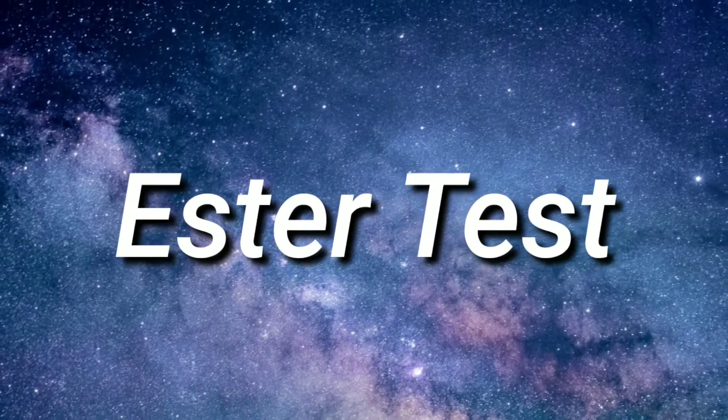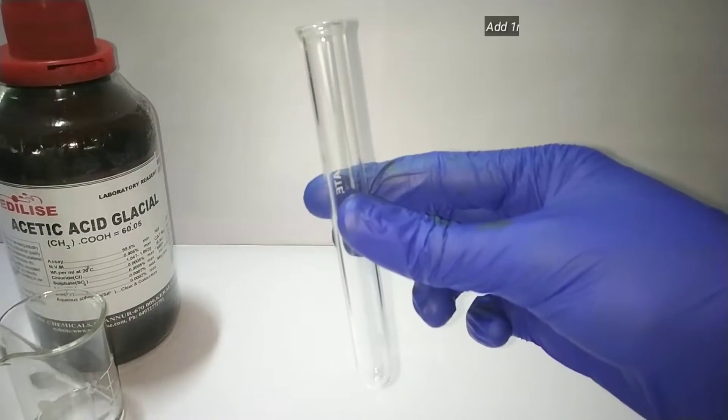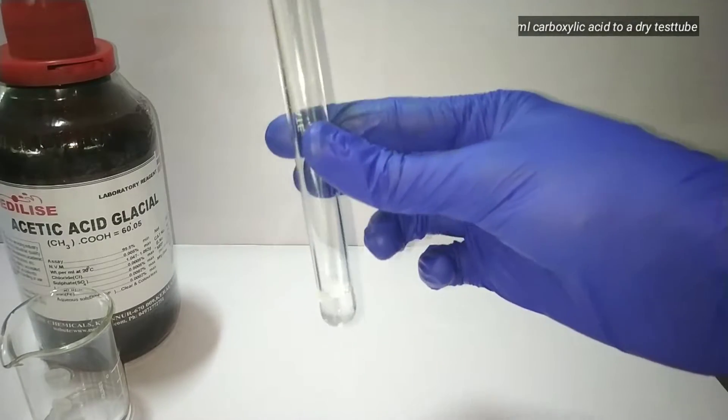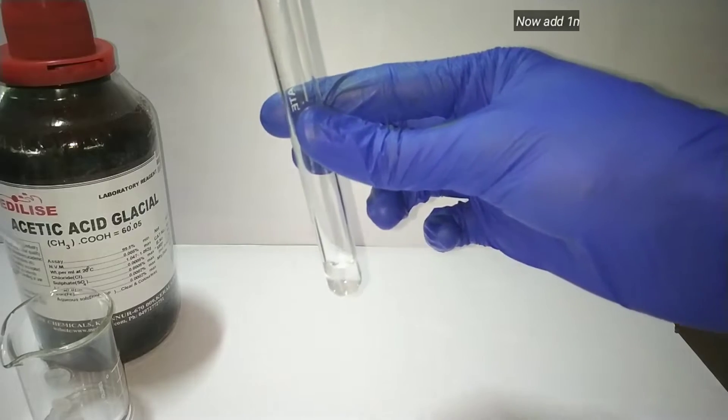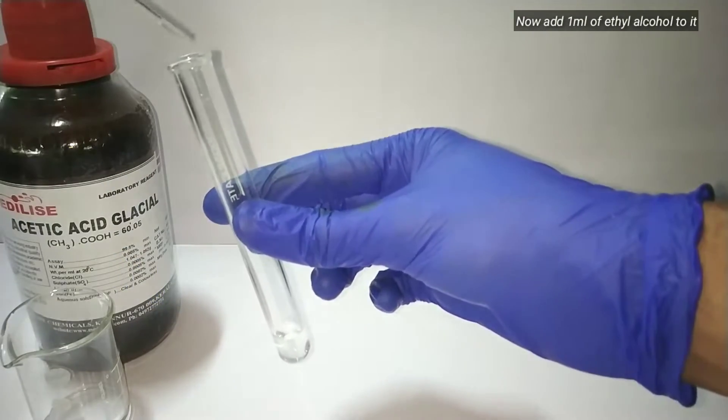The next test is the ester test. For that, we take a clean and dry test tube and add one milliliter of the carboxylic acid. Then I add equal volume, one milliliter of ethyl alcohol.